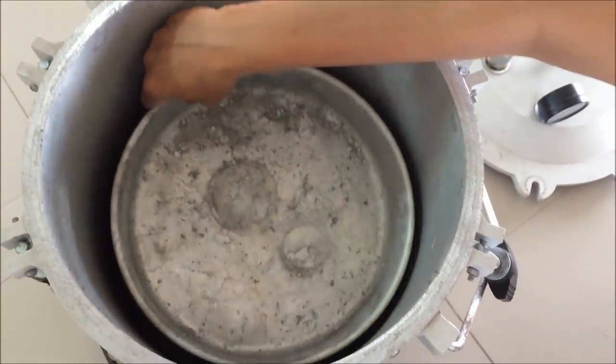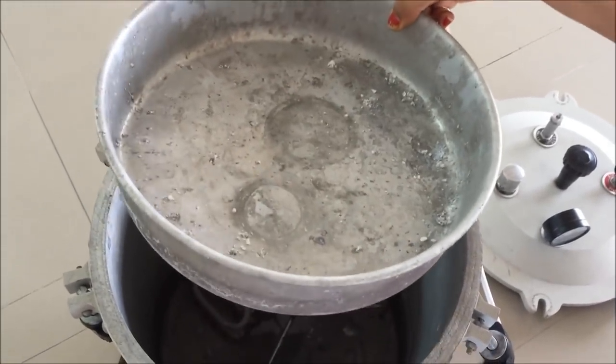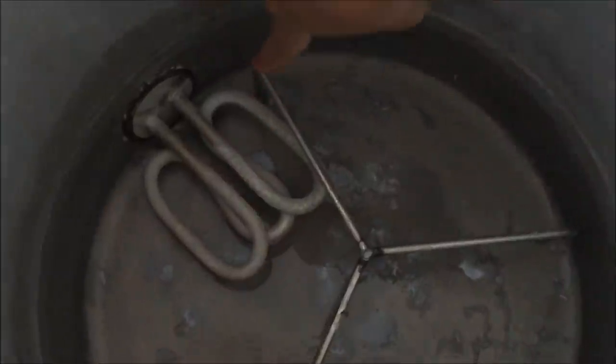This is the inner view of autoclave. It is a tray. It serves a basic purpose to keep the object which has to be sterilized. And at the bottom of autoclave there are two small parts.